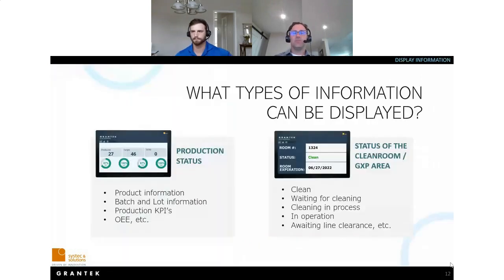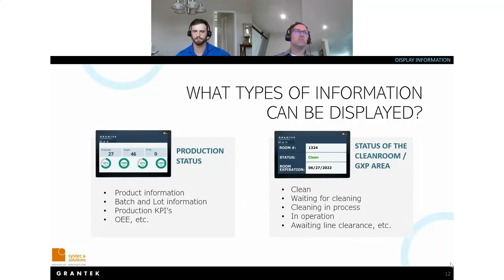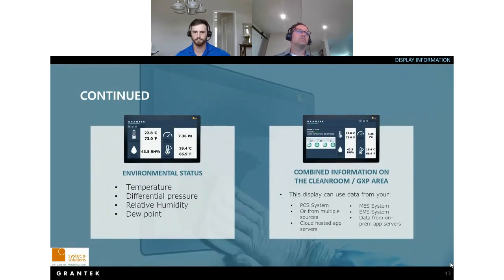Here are examples of information that might populate a digital signage system. On the left you have production status: product information, batch and lot information, and production KPIs like OEE. On the right you have the status of a clean room or GxP area — whether it's clean, waiting for cleaning, or cleaning is in process — along with a room expiry showing when the clean status expires. Additional examples include environmental status such as temperature, differential pressure, relative humidity, and dew point, as well as combinations of multiple data sources.